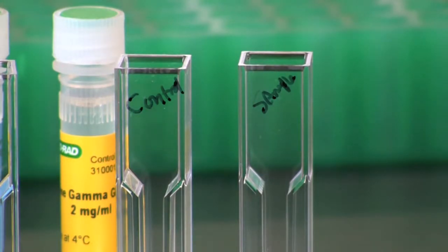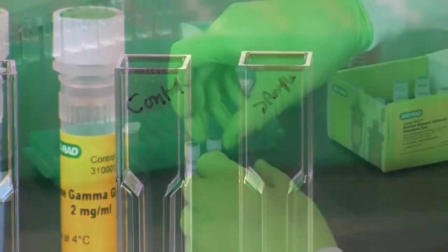Pipette 20 microliters of diluted milk sample into the cuvette labeled sample and 20 microliters of 1x PBS into the cuvette labeled control.